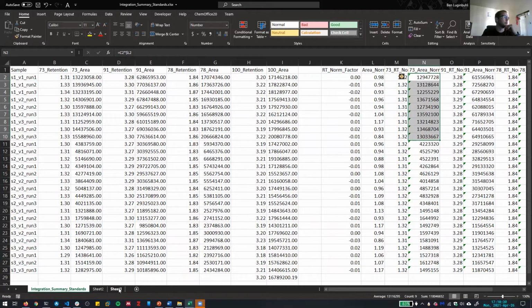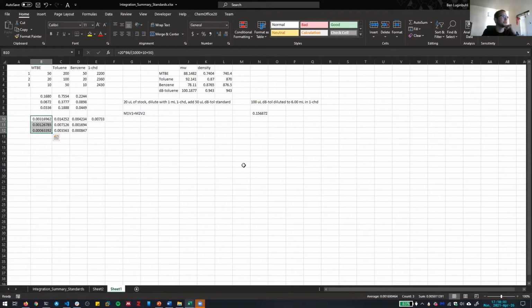And so remember what we did is we built this little spreadsheet here, which I haven't really labeled again, but you guys can go through and make sure it's labeled appropriately. We took our data that contained our actual solution preparation details. So these are microliters of each of these analytes and then the solvent they're dissolved in. And then remember, we did this calculation that calculates the concentration of these stock solutions using the molecular weight and the densities, which we looked up online.